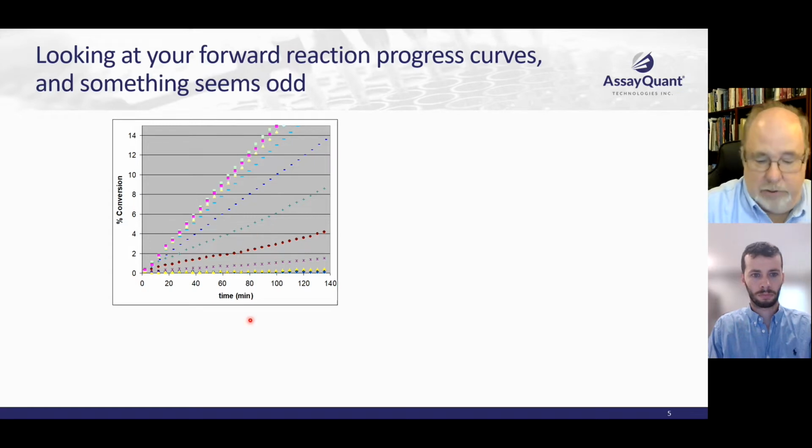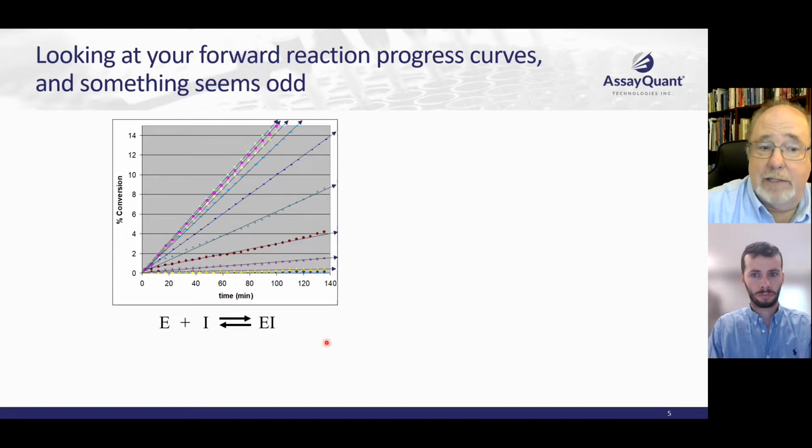And that makes it just fine for this type of binding reaction where your inhibitor, your compound, is binding to the enzyme to form an enzyme-inhibitor complex. And you've got an on rate and an off rate, and the IC50, you can use that to calculate a KI, which is a kinetic estimate of the KD that you would get from this, which is the off rate over the on rate. All that makes sense. You learned all about that in your basic biochemistry classes.